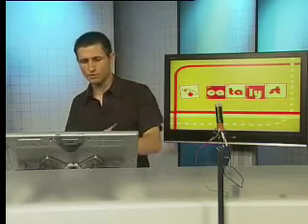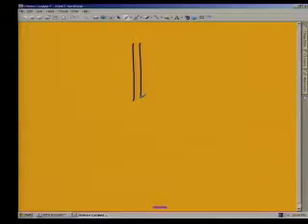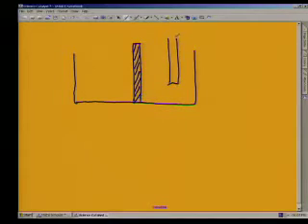So we've got a cell which is now divided by this porous asbestos membrane. Just remember, if they ask you in an exam why this is no longer used, it's because asbestos is very, very poisonous. It causes cancer of the lungs. Very not nice. So I've used a little bit of filter paper because I'm not that fond of getting hurt by my experiments. We're going to take our porous membrane and put in 2 electrodes. Remember that electrodes carry the current into an electrolytic cell.